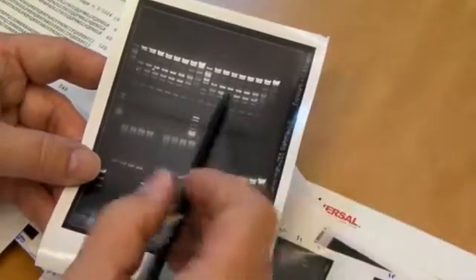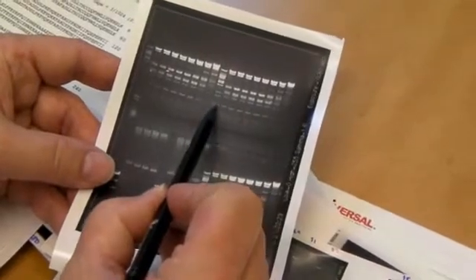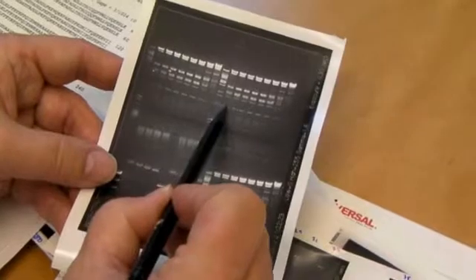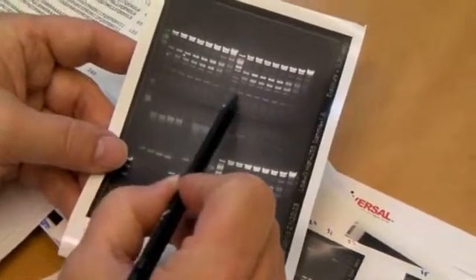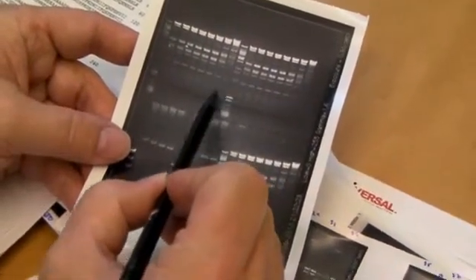So that tells me where I am in the gel on this particular one. So it's a control, and it tells you I can compare this to my known piece. This known piece is 1,274 base pairs, so that's a little bit bigger. That's maybe 1,280, 1,290, 1,300, something like that. The question I'm answering here is how much enzyme do I have?